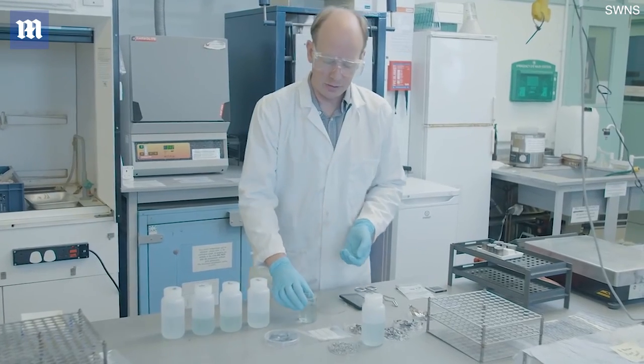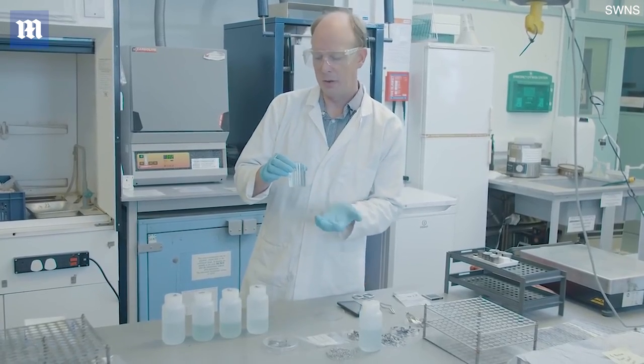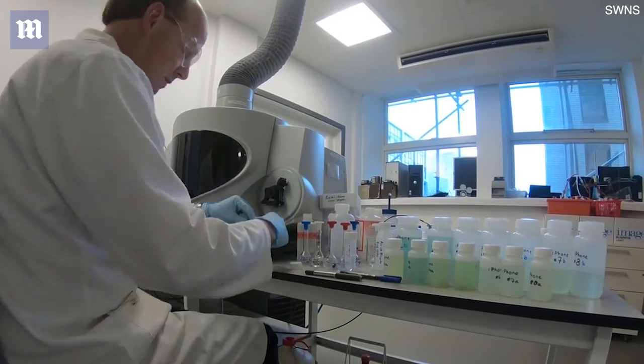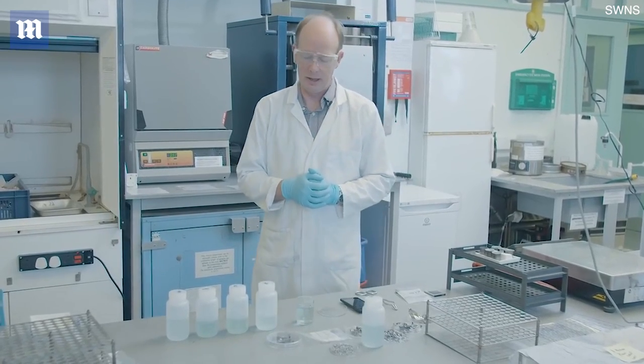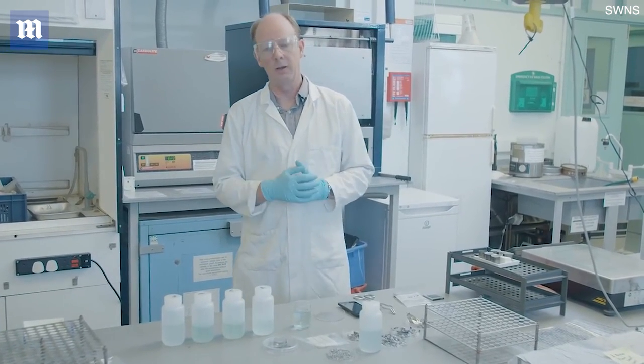And this solution, we can actually analyze the contents of all the metals and all the elements that are in here in a mass spectrometer here at the university. And then we have a result. We know what's in there in these phones, and we can actually work out how much of which elements is in there, and we can actually try and work out where they're coming from.